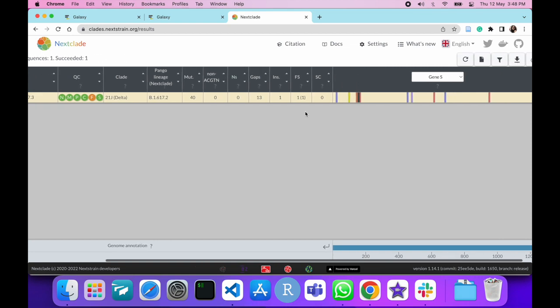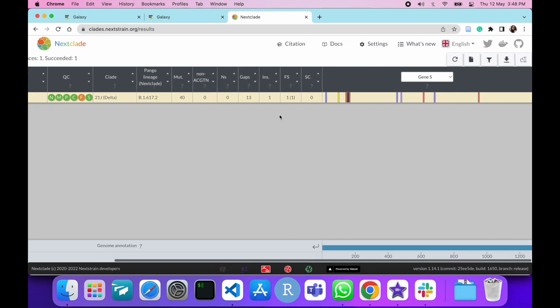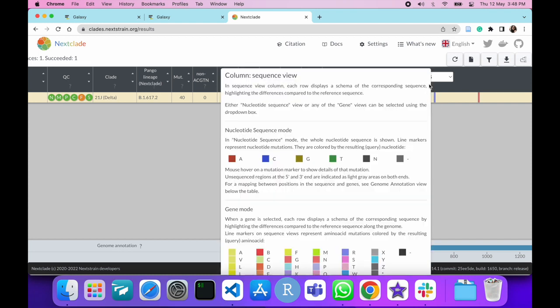In addition to it, it displays each gene and SNPs at various positions in that particular gene.